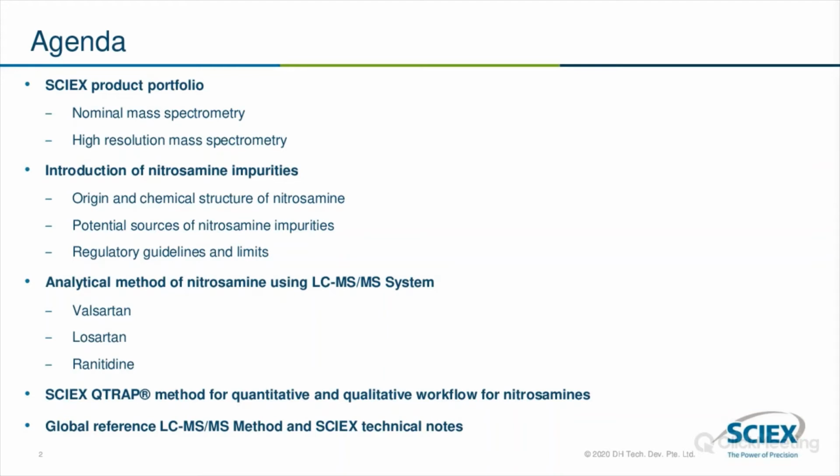introduction of nitrosamine impurity. I'll also be showing you some of the analytical methods of nitrosamine that the Sciex lab has developed. Some 3 examples, we will be showing you Losartan, and ranitidine, and some of the methods which we are not showing, you can talk to our marketing team and other team members to get more information.